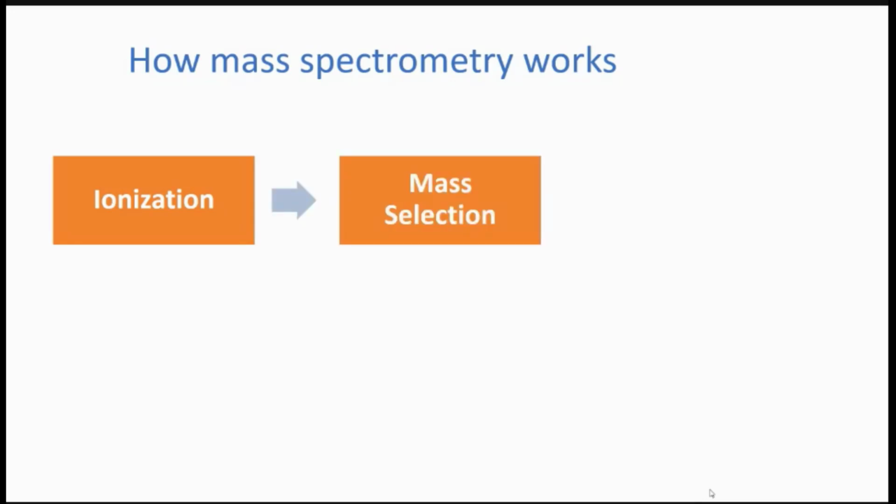And then after that, the mass spectrometer actually selects masses. That's one way to think of it. There's some sort of protocol that you tell the mass spec to say, look at these masses and not those masses, and there are quite complex instructions you can give. You can think of a mass spectrometer almost as a filter, because it will select what you ask it to.